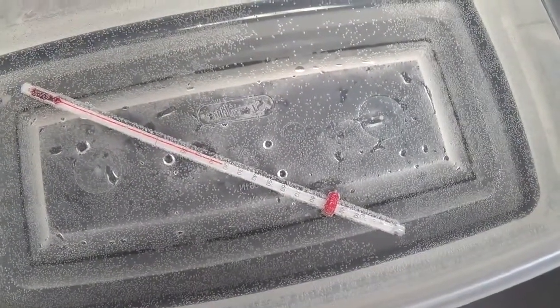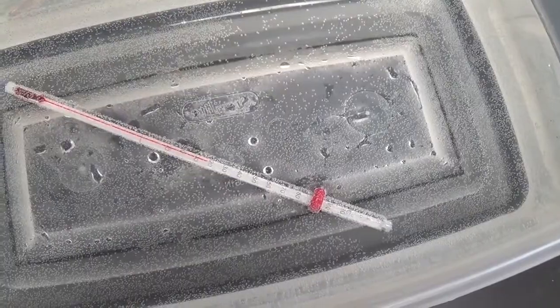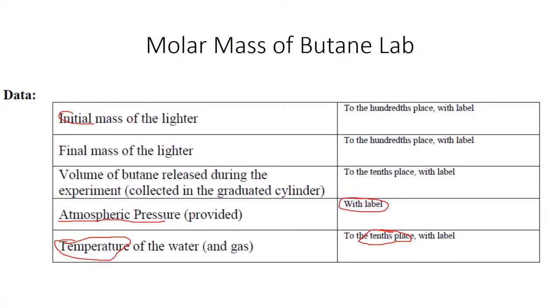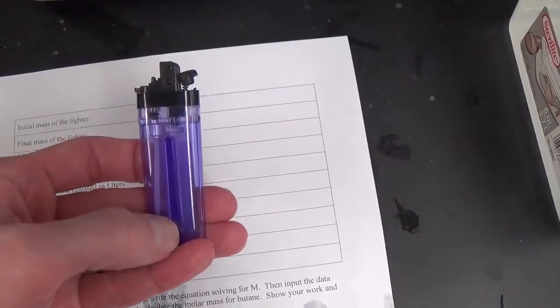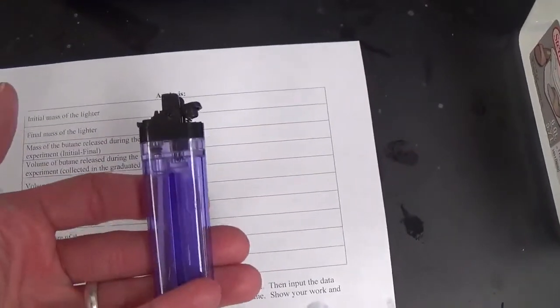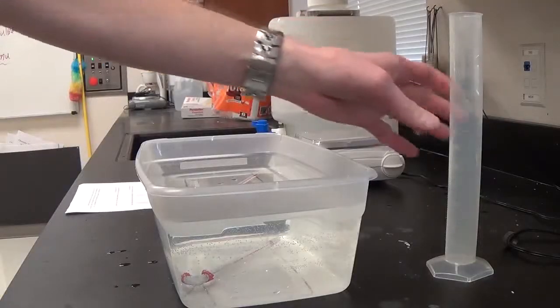The thermometer is in the water so that you can get the water temperature. Remember to read between the lines. We also need the initial mass of the lighter. You have to start that before you put the lighter in the water. Make sure that the lighter is completely dry. Blow on it and everything to make sure.